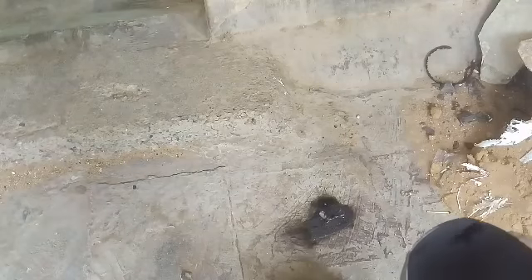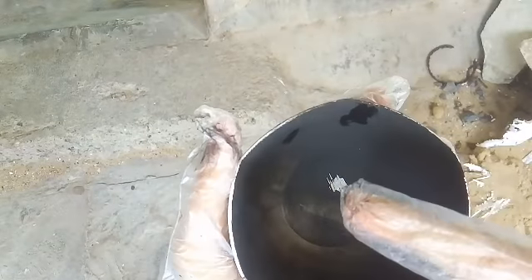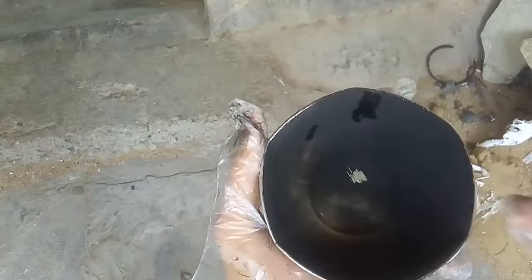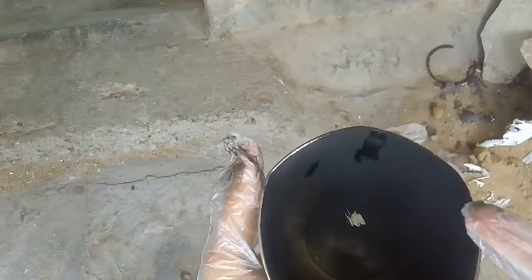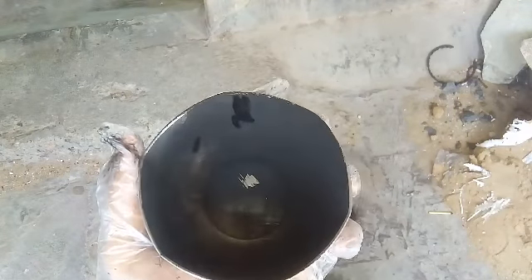Okay, so I have done the reaction actually, and you can see on this cup I have lots of carbon on it. We can see here some scraped off, so you can see a very uniform layer of carbon formed on this cup. Okay, so let's go back to the lab. This is the carbon. Let's go to the lab and let's do the analysis on it. Scrape off the carbon and purify it to see what we have.